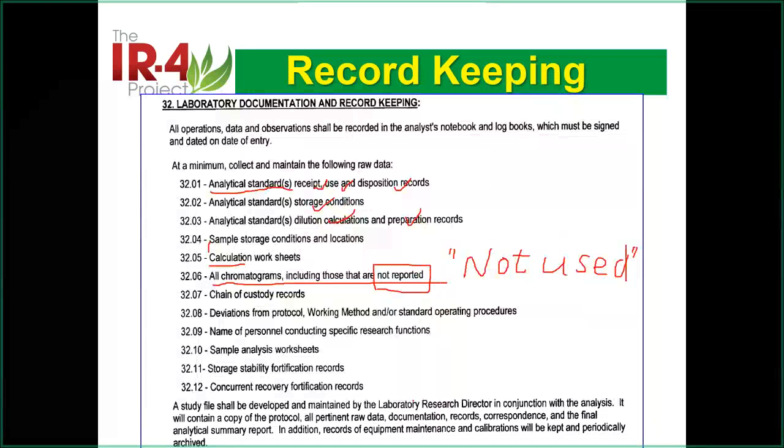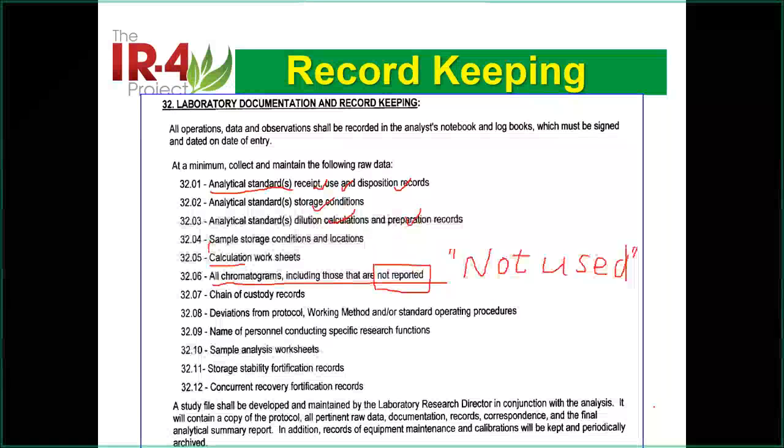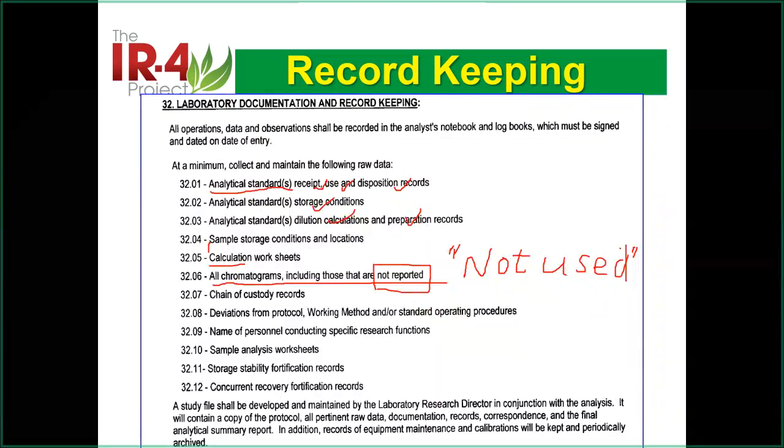Okay, I made a mistake for the extraction, or the instrument is not good. There's a whole analysis, the whole set is not passing the recovery. So we're not using it in the report, but you still keep that. So I put a quote there, "unused data."